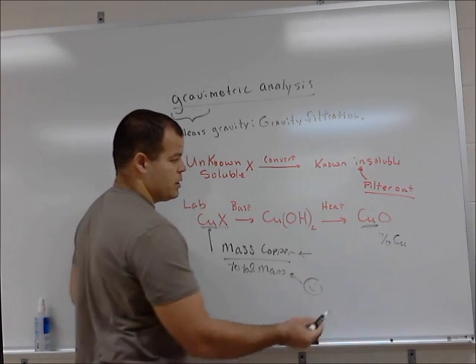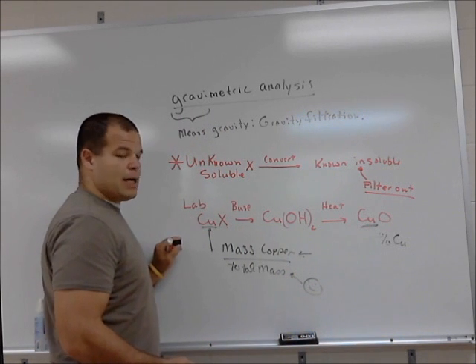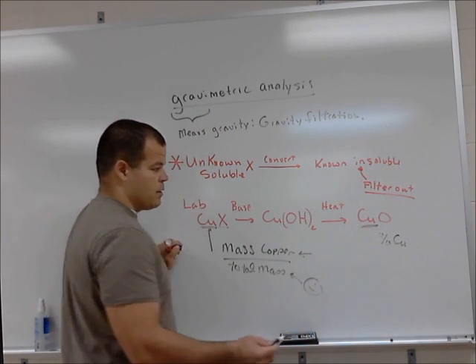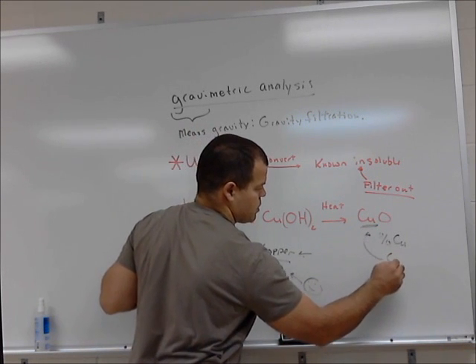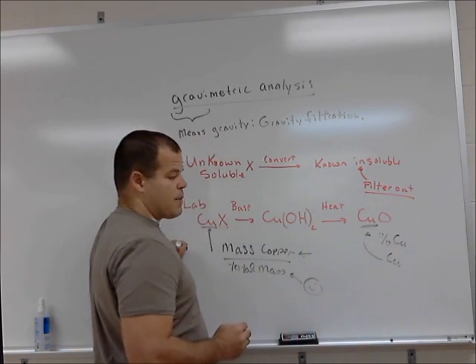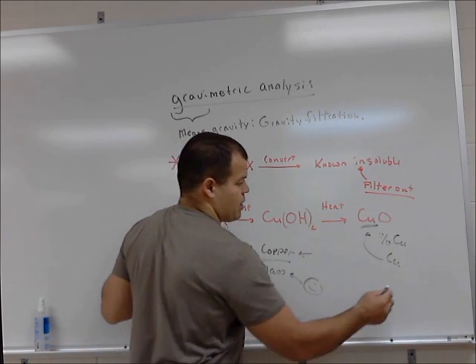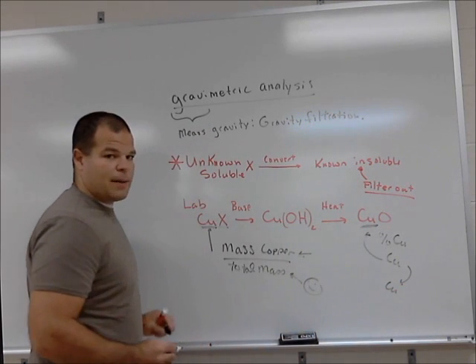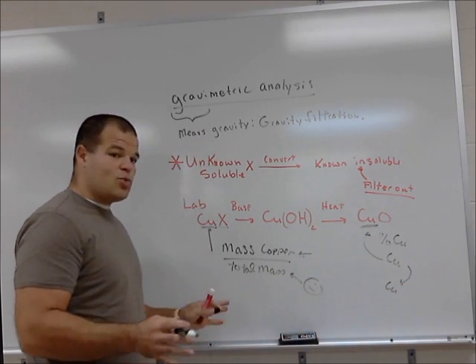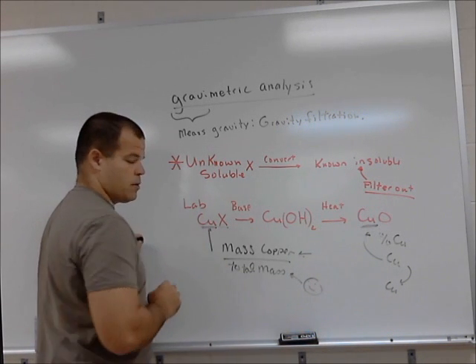So step one, again, verify my calculation, the percent copper in copper oxide. Then take your unknown sample and determine how much copper is in your now known sample. From there, you'll be able to determine the mass of copper in your copper oxide, which, if you didn't lose any along the way, should be good to go as far as the mass of copper in here.